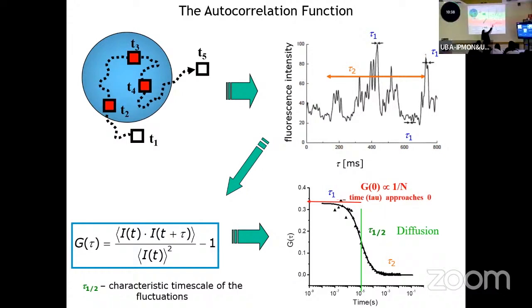At this point in time we don't get any data, but we extrapolate the function to get this value. And you can do it by eye. I'm just looking, 0.32 or something like this. That would be my G of 0. So that would be 0.3, let's say, is equal to gamma divided by n. We solve for n. We know what gamma is. And that's how we get n.